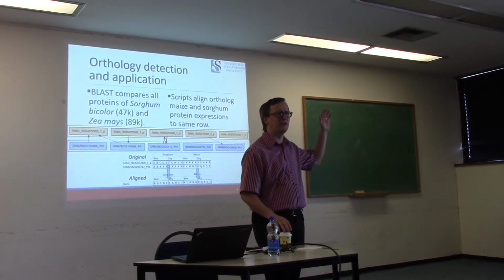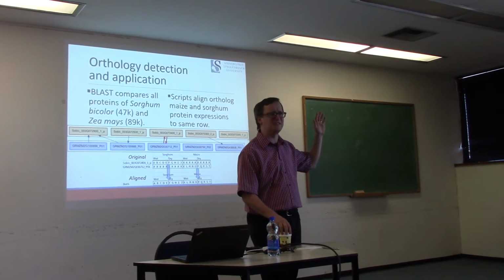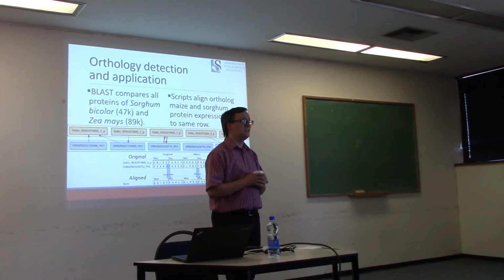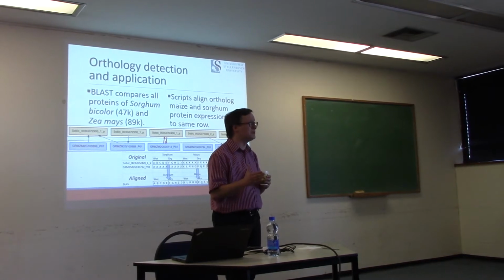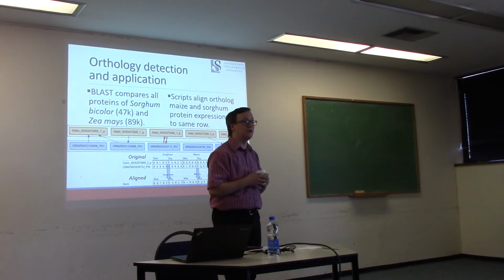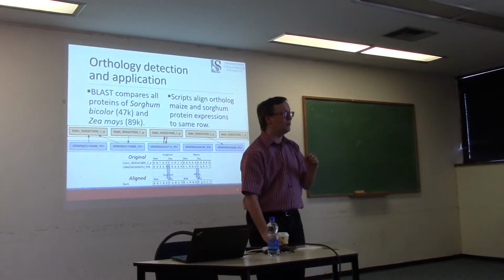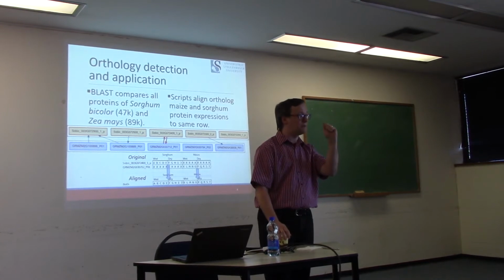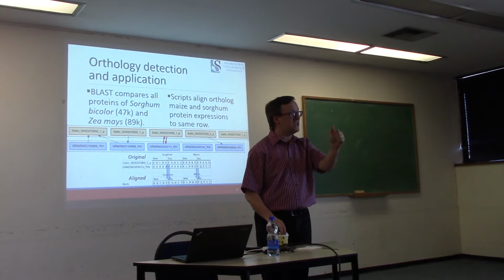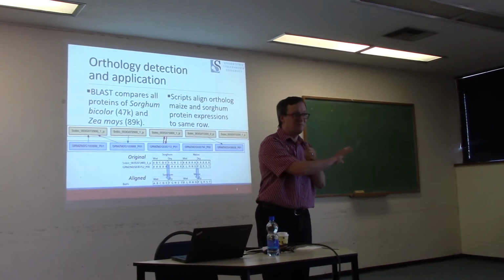I think everyone here has probably encountered BLAST at some point in their lives. Right, so BLAST is really good, but you don't have to use the web server. You can, in fact, download BLAST and run it on databases there on your own computer. And we decided we needed to do that because in this case, we were going to search for every sorghum protein in maize. And we were going to search for every maize protein in sorghum.